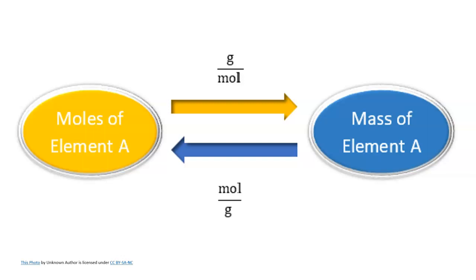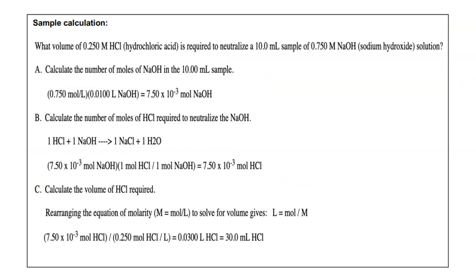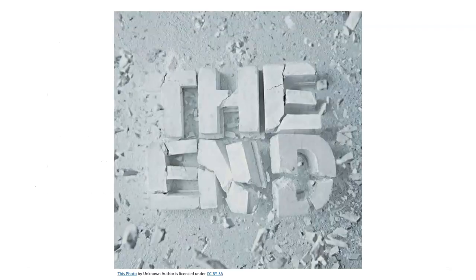Just a quick reminder about moles to grams, grams to moles. You're going to figure that out with how much NaOH that you need, okay? So be ready for that. These are available to you in your lab, this slide, and this slide. They are all available to you in your lab. I need you to look over those. If you have questions, please bring them to class with you so we can address those questions in a timely manner. So that's it. That is it for our titration lecture.